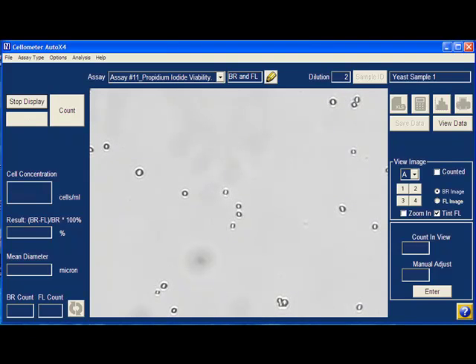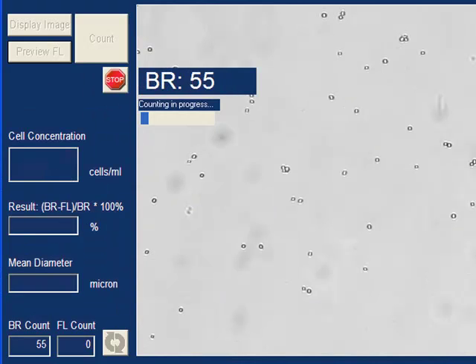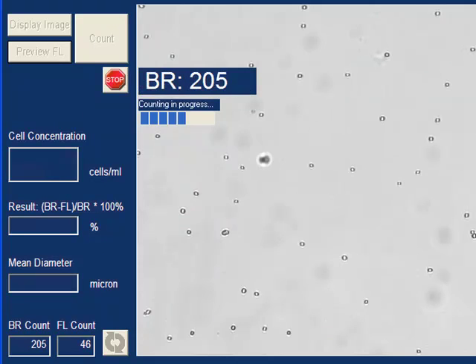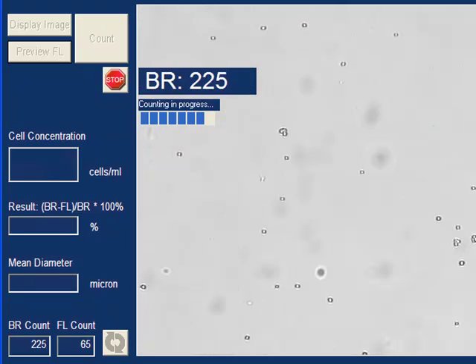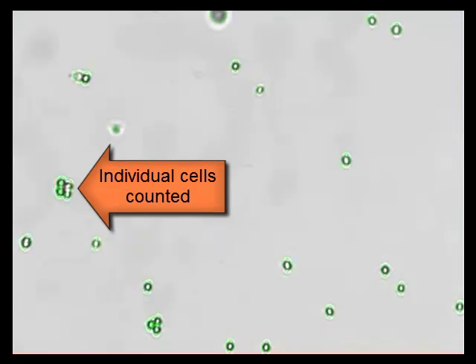The Auto X4 counts all of the yeast cells in the brightfield image to determine total number. The brightfield counted image indicates individual cells counted within cell clumps.